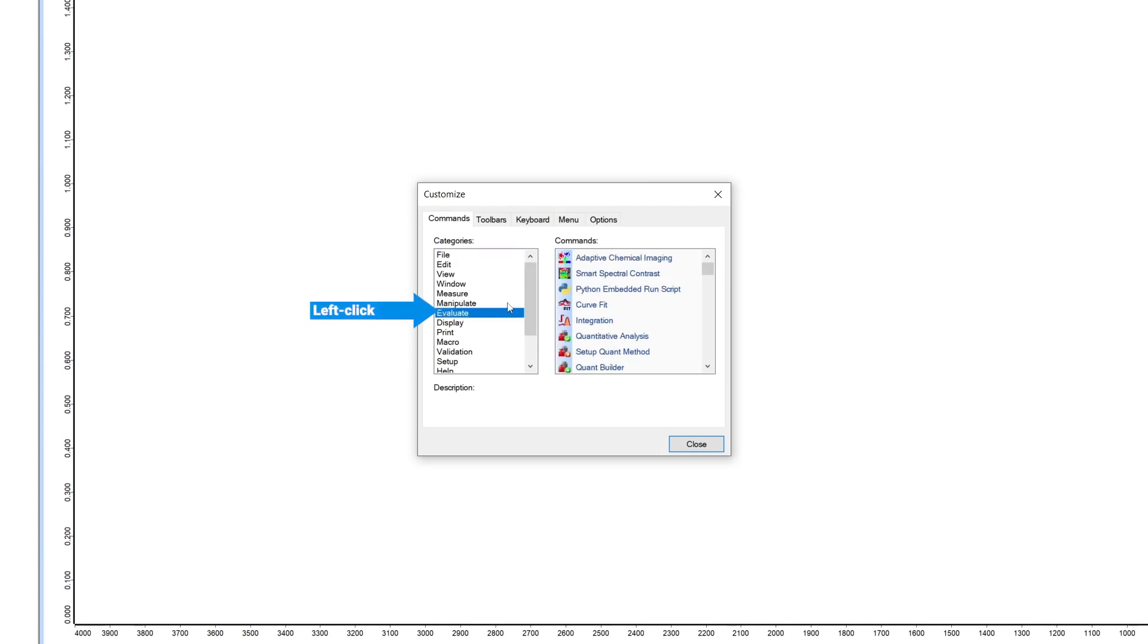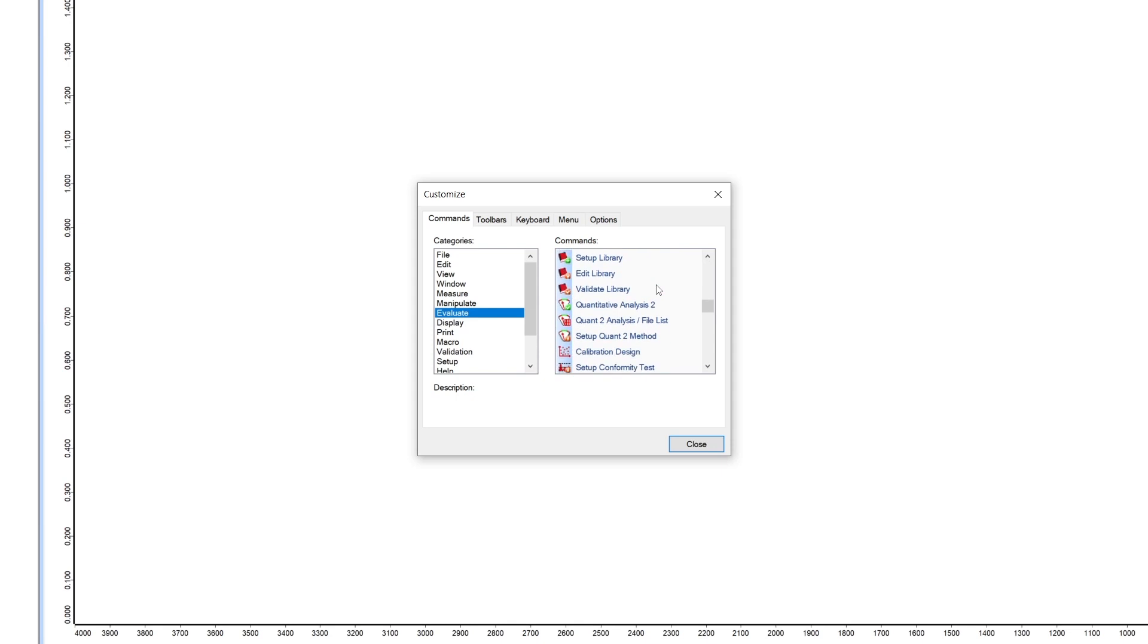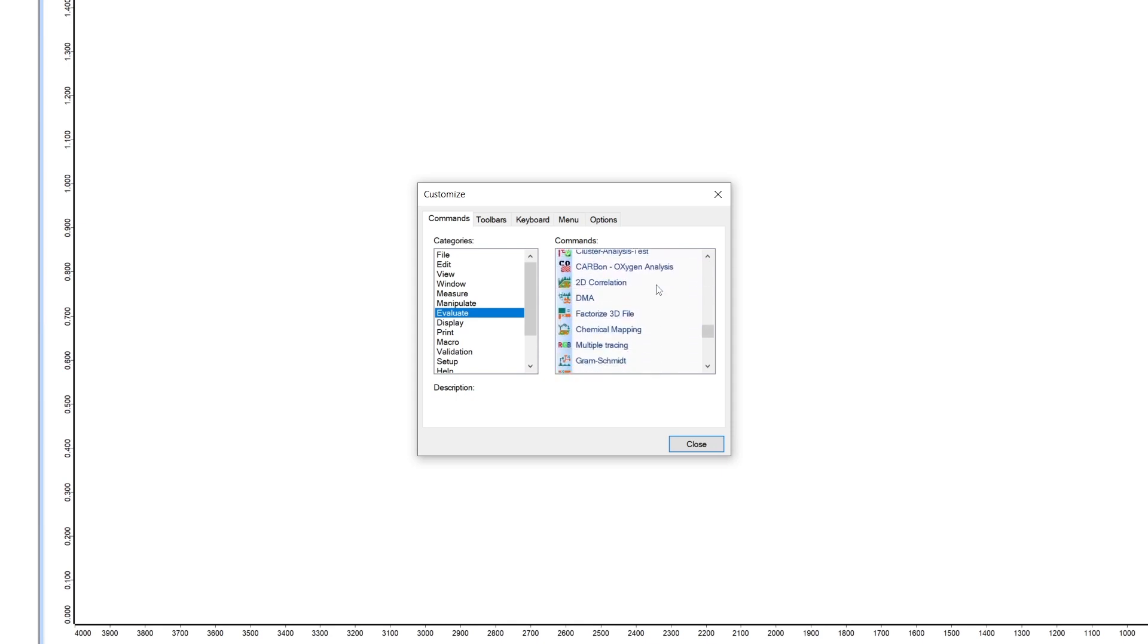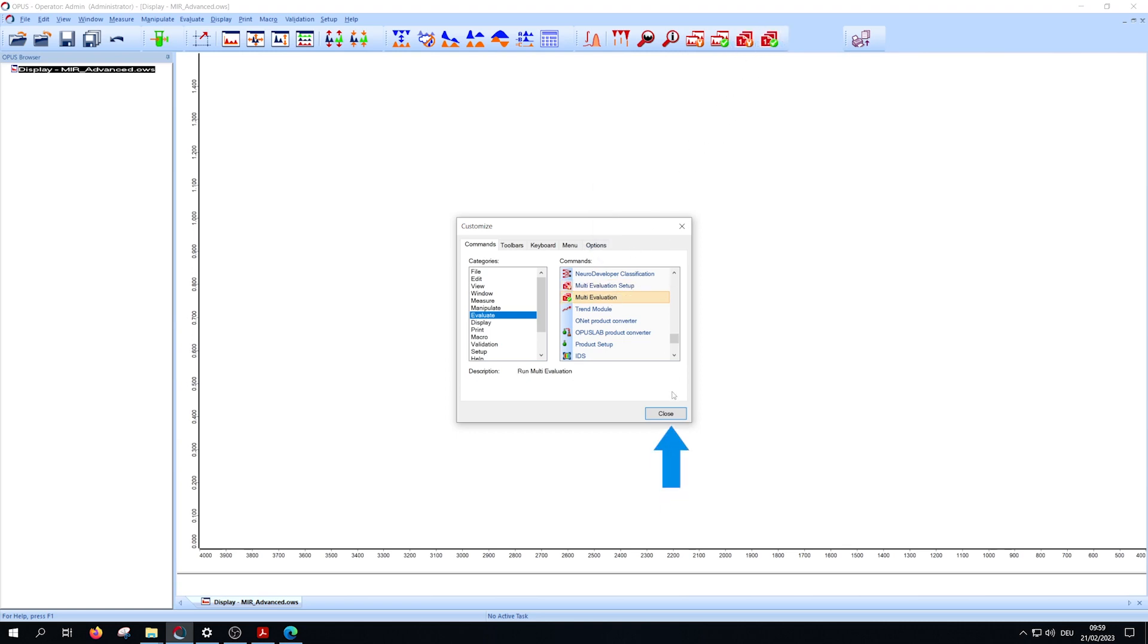Left click on evaluate and then scroll down to multi-evaluation and multi-evaluation setup. Add them to your toolbar via holding left click on them and move them to the place where you want to add the buttons. Close the window.